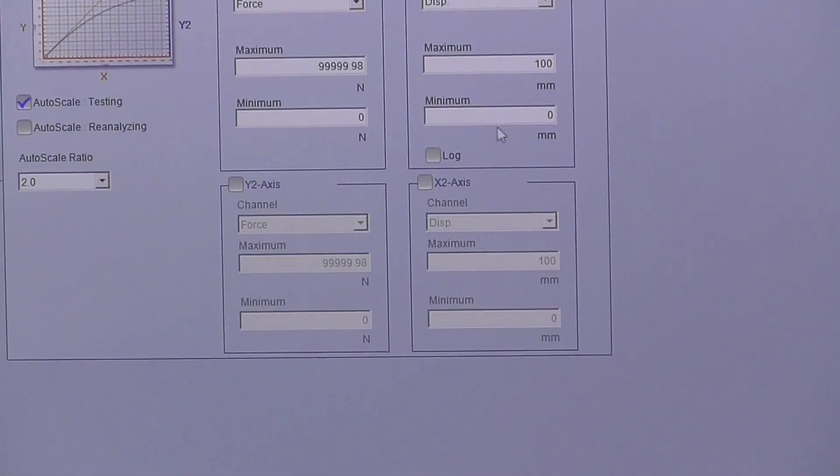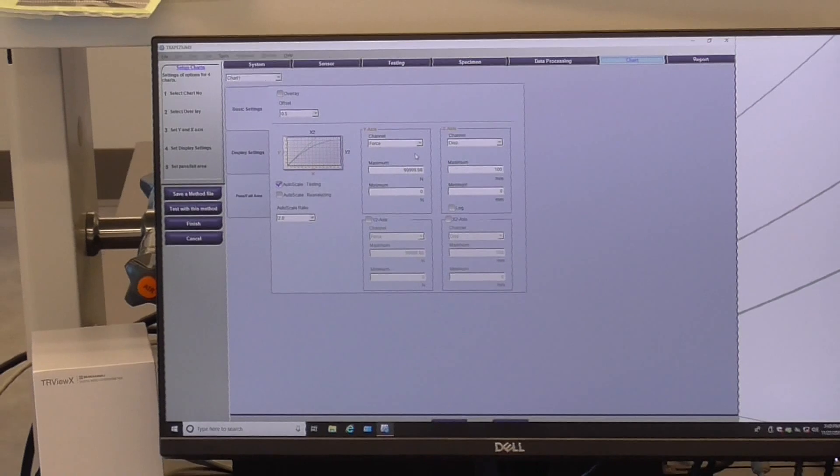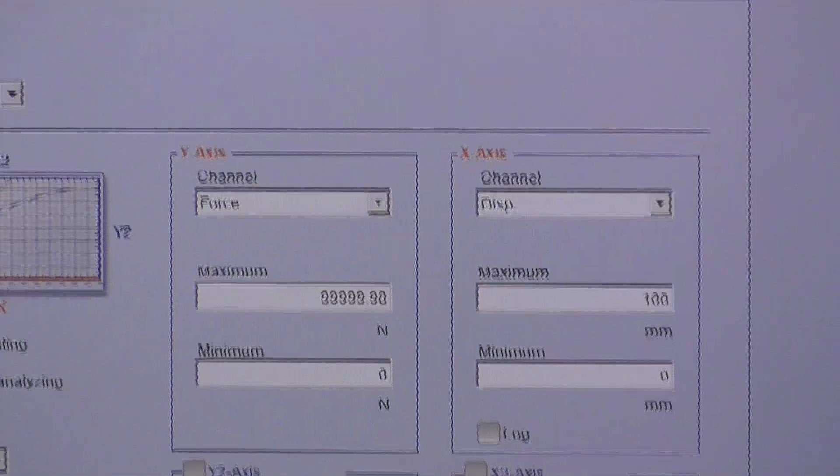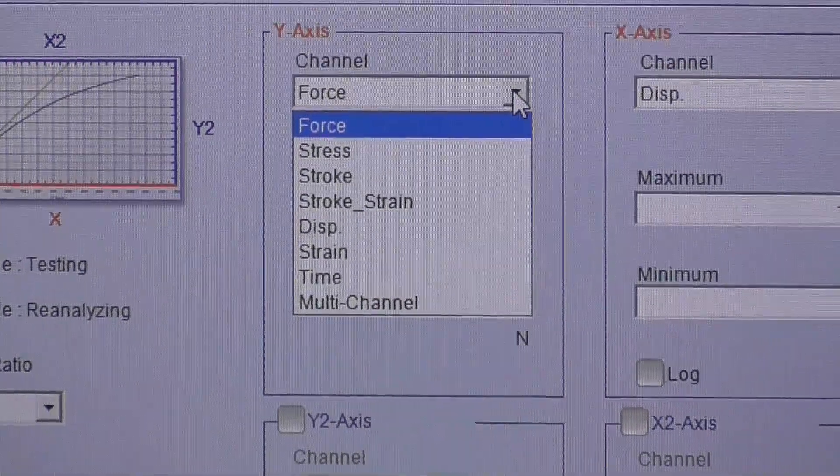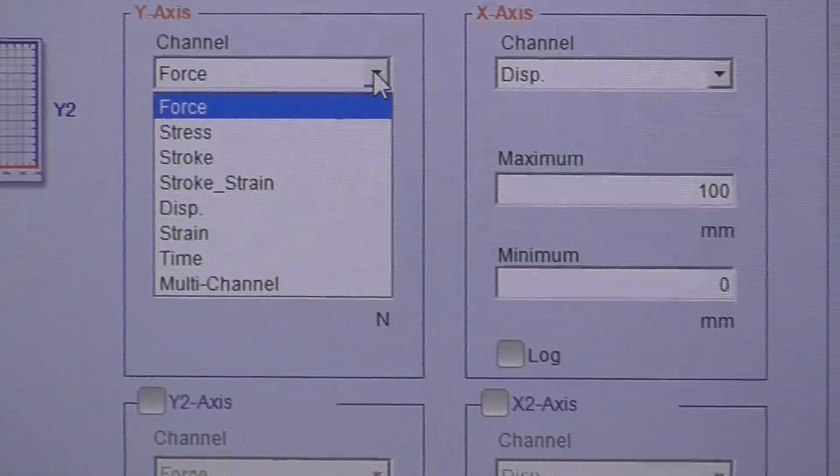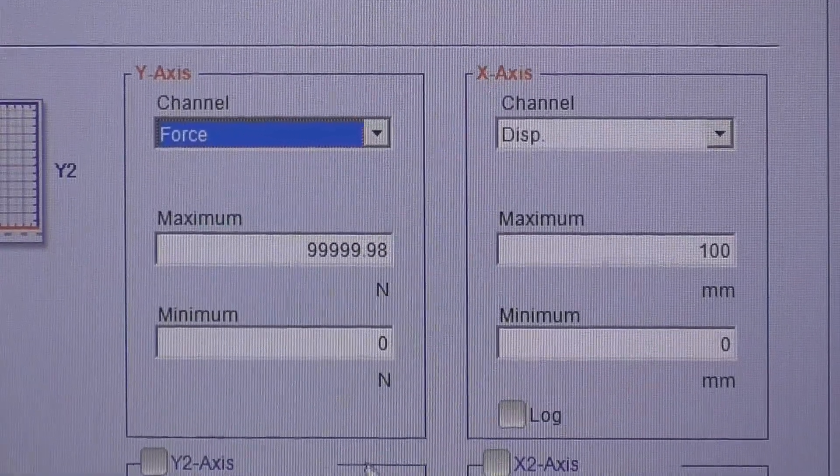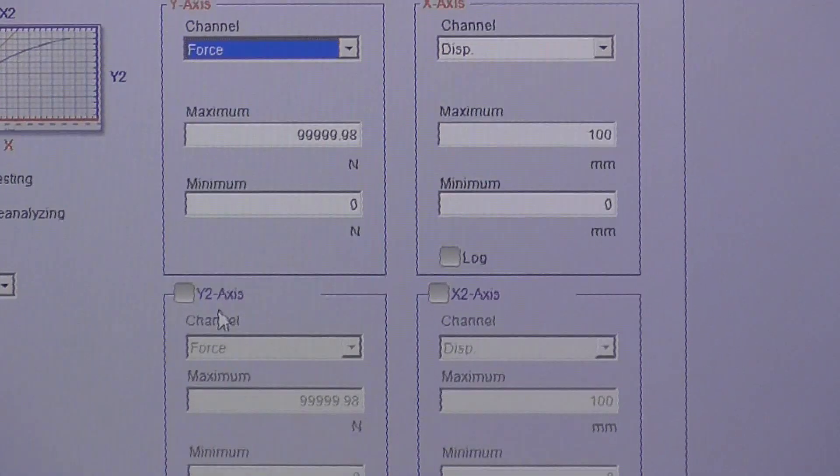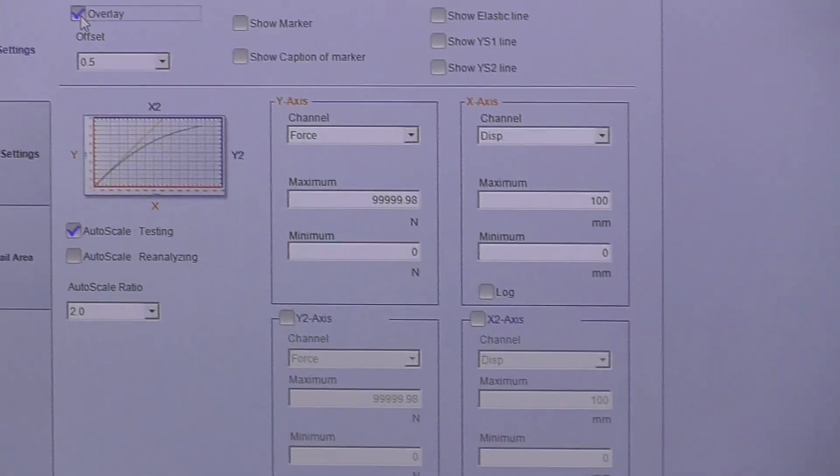So going to the chart, I'm almost done. So this essentially defines how the chart displays as your test is running. You can have up to four charts. You can define your x, y axes based on any channel, any sensor channel that you've either defined or come standard with it so far. You can have multiple axes. You can have a y prime, x prime, and also a secondary y and x axes. You can overlay the data if you want.